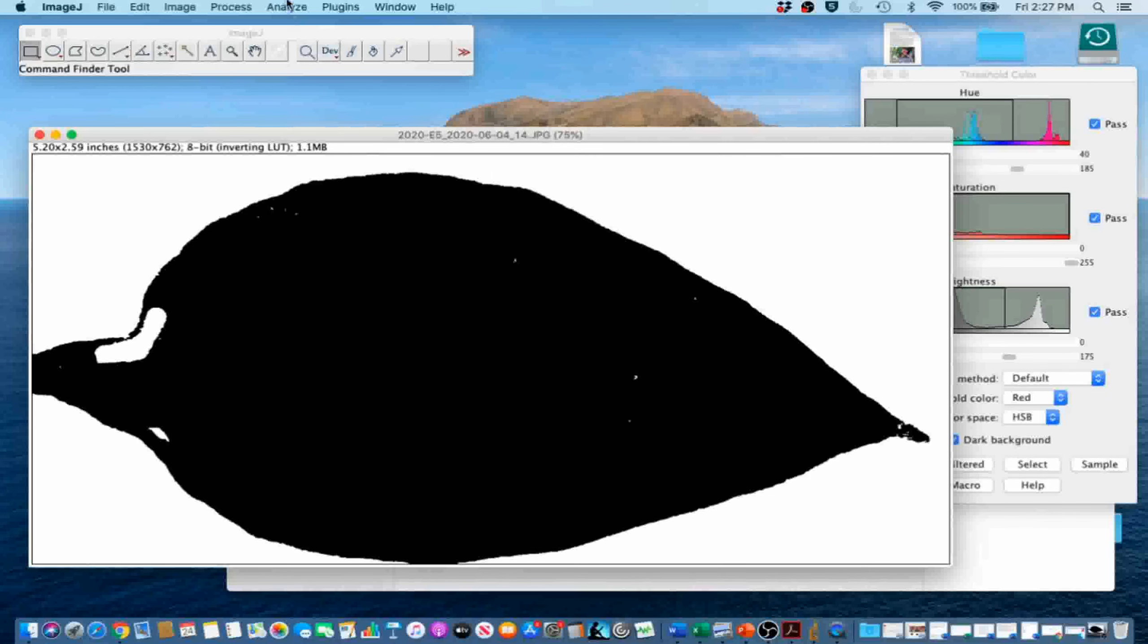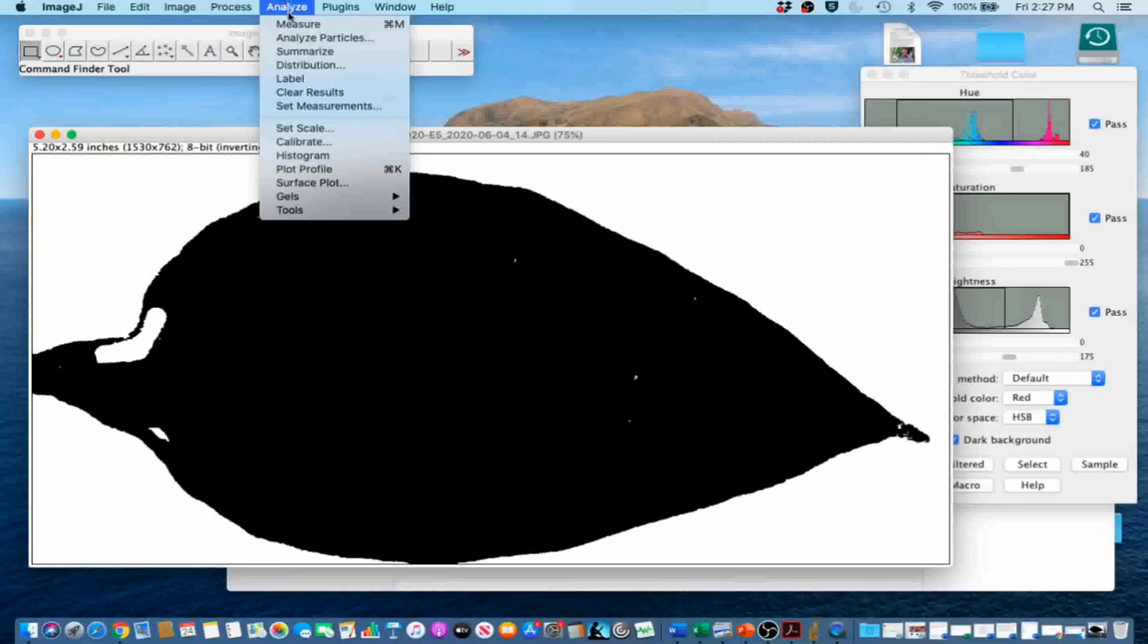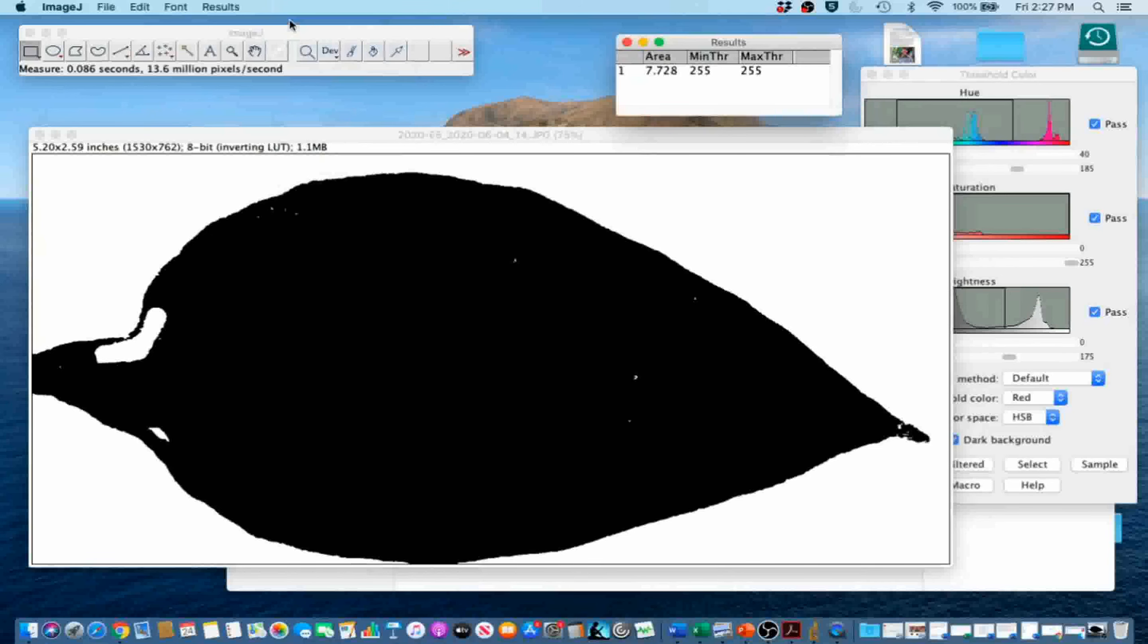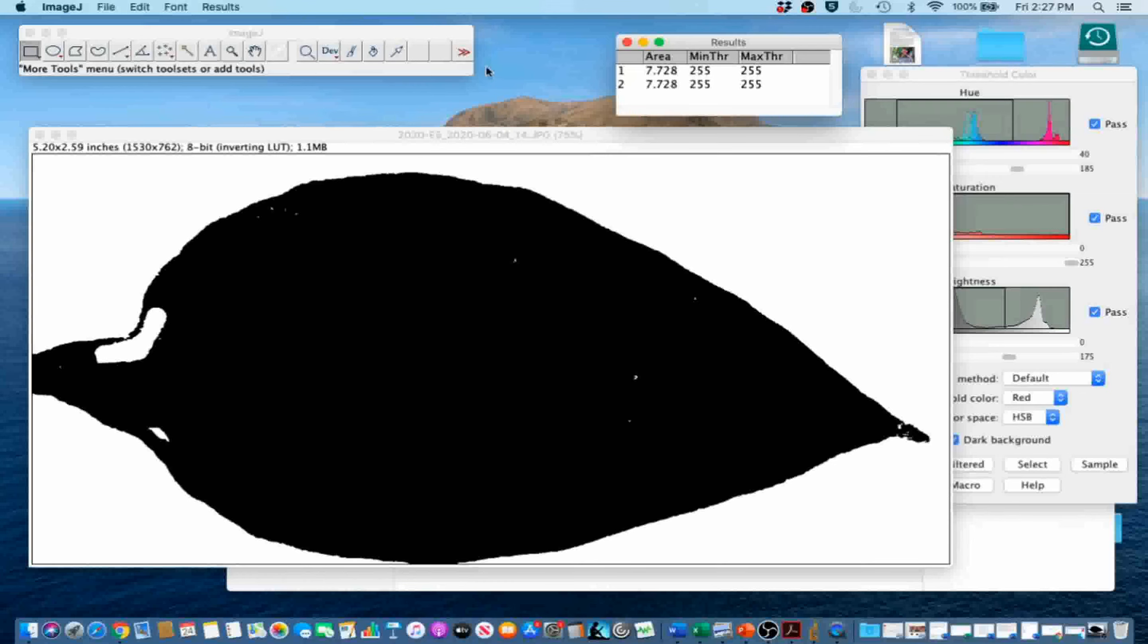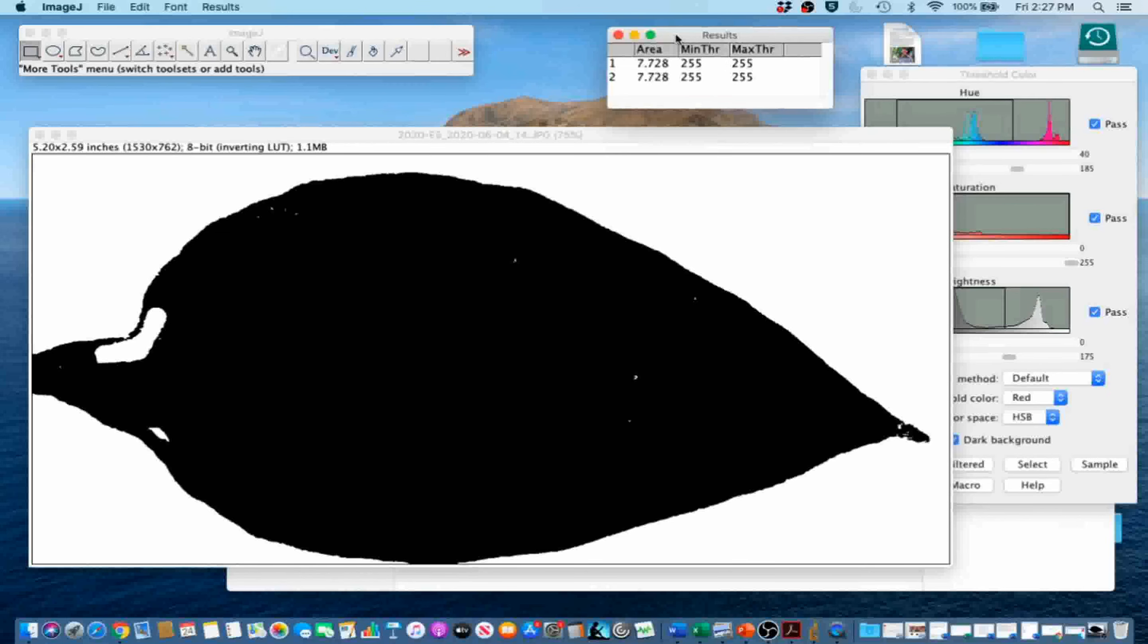Next, go to Analyze, Measure, or you can also select Control-M to measure the leaf area. So this is our leaf area measurement.